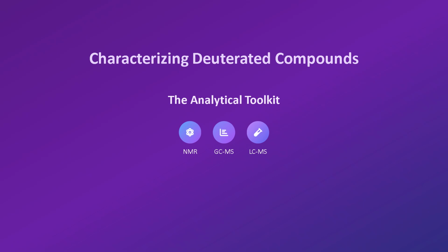Over the next 10 slides, I'll take you through how NMR, GCMS and LCMS work together to turn that invisible isotope swap into solid, defensible data.